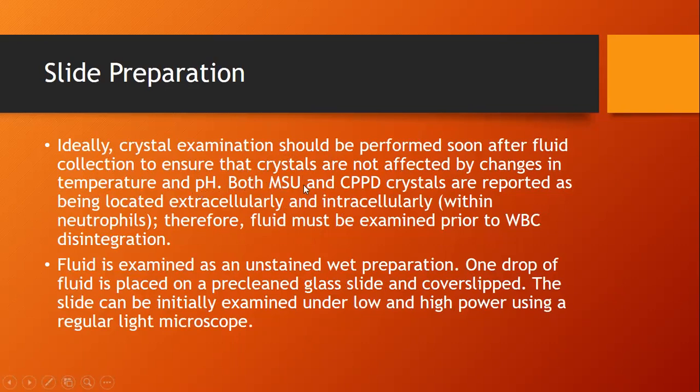Both monosodium urate and CPPD crystals are reported as being located extracellularly and intracellularly within neutrophils, and therefore fluid must be examined prior to WBC disintegration. That's why we do this immediately after specimen collection.